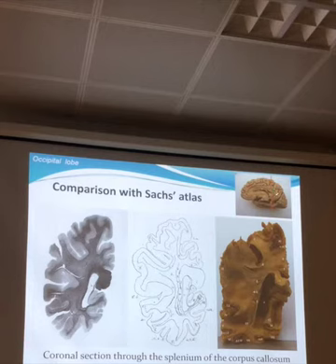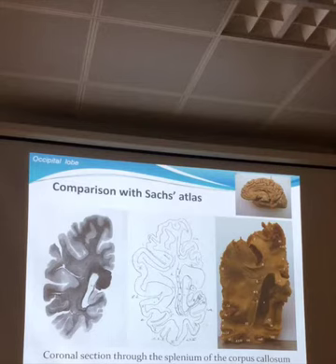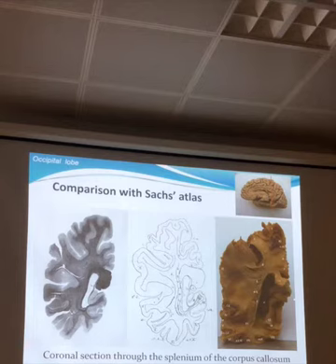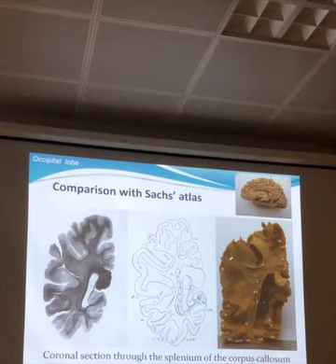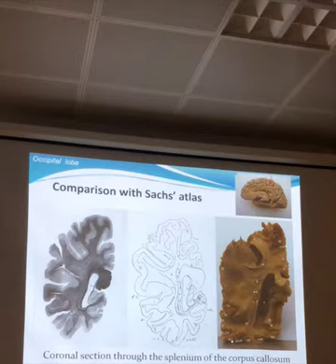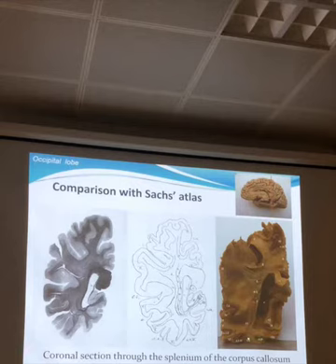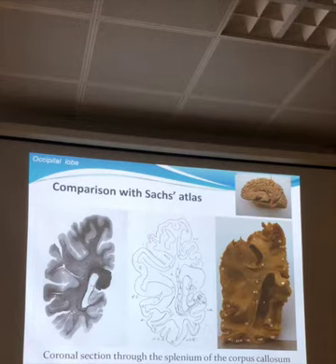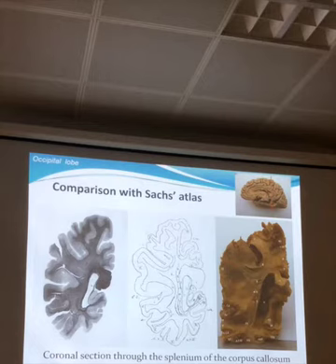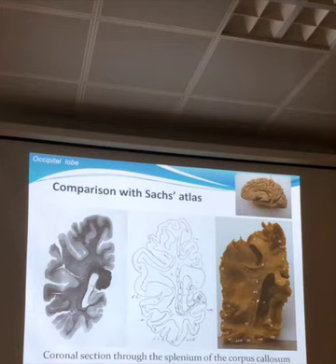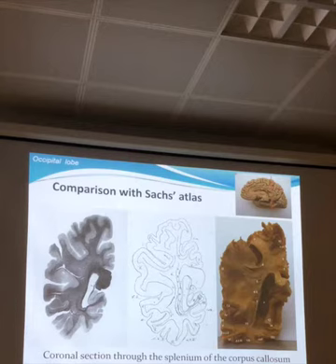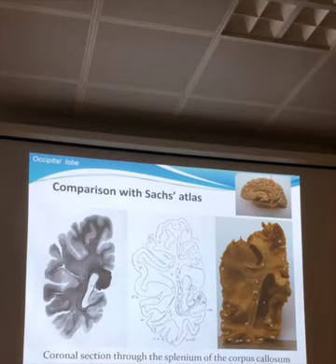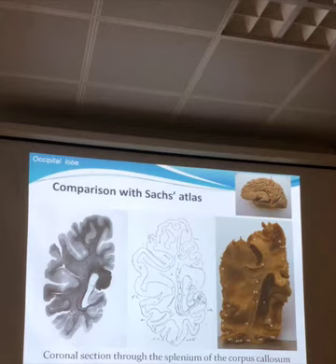On the left, you have Sachs's original histological slide and his prepared diagram; on the right is our Klingler dissection. This section is taken at the posterior edge of the corpus callosum. You can appreciate the vertical anatomy with the superior and inferior parietal lobe, the Sylvian fissure, the superior, middle and inferior temporal gyri, and the collateral sulcus dividing the fusiform from the parahippocampal gyrus. On top of the ventricle sits the splenium of the corpus callosum, with tapetum fibers fanning around the lateral ventricular wall, and lateral to those, longitudinal fibers of the stratum sagittale representing the optic radiation and IFOF together, with the arcuate fasciculus coming around as well.